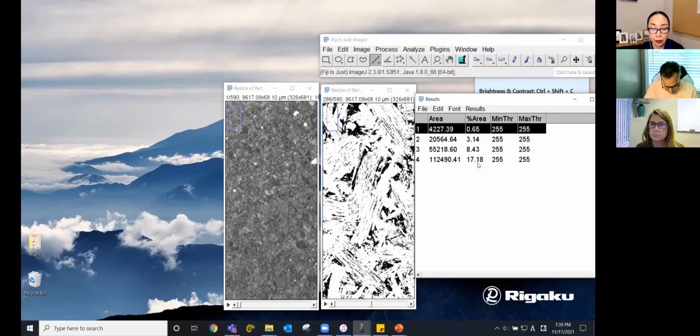VG Studio has its own as well. So you can use a third-party reconstruction program as well. But usually the scanner has a reconstruction program on it. Okay. Several more questions.